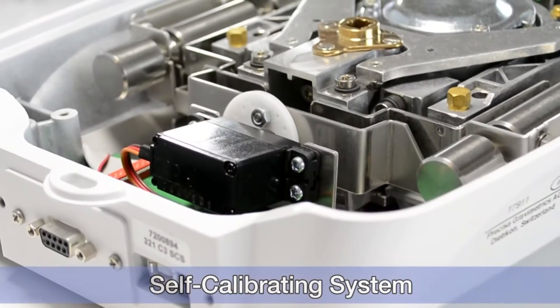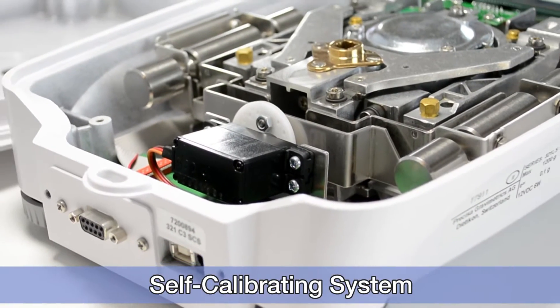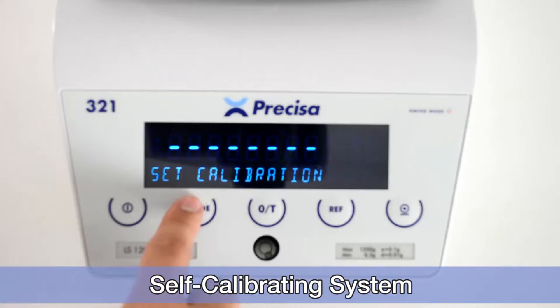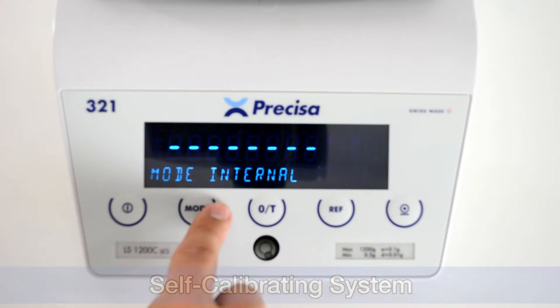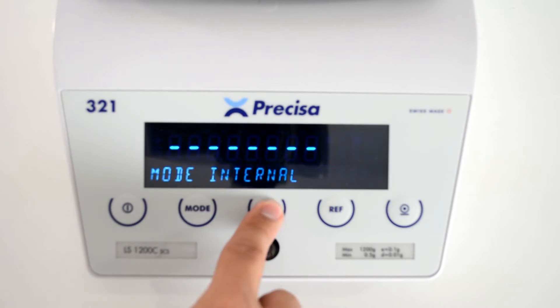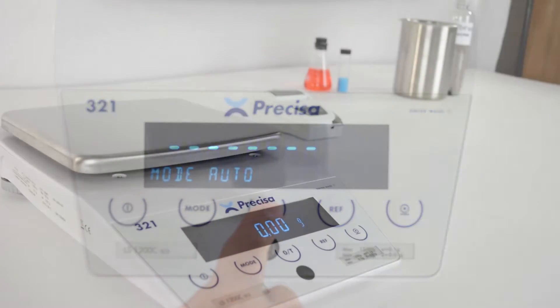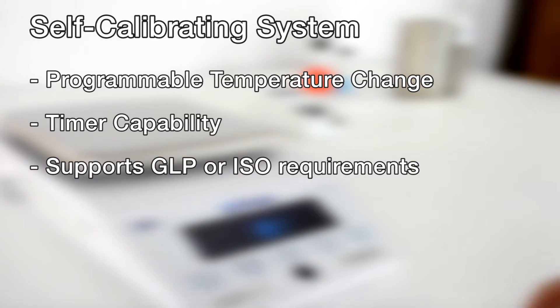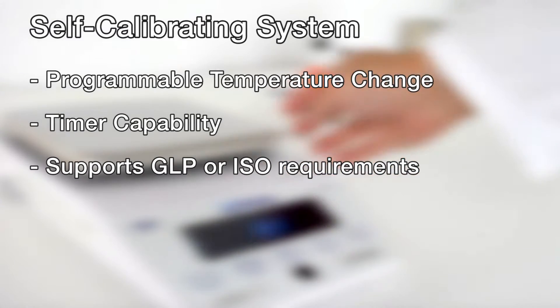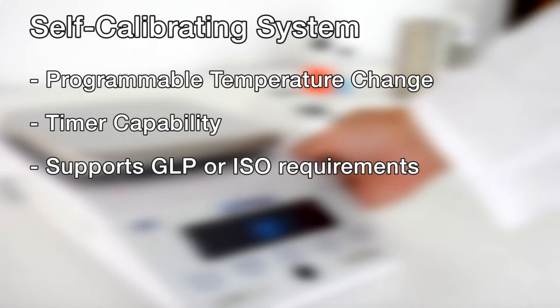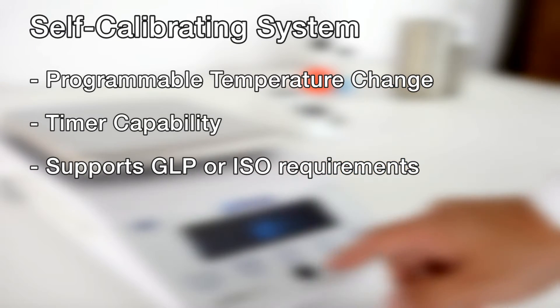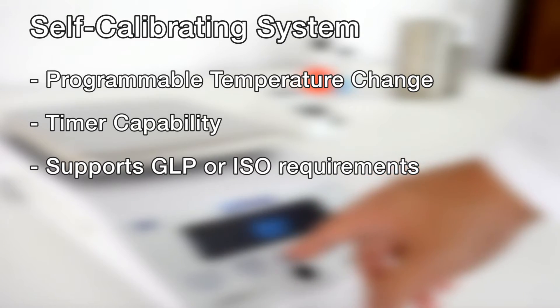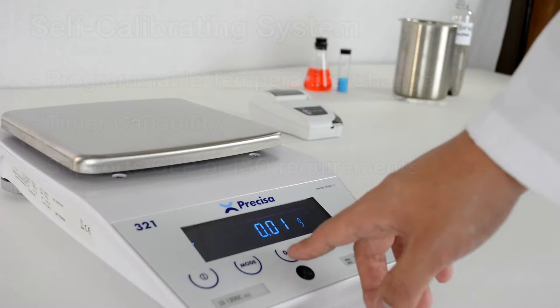The self-calibrating system, developed by Precisa, enables true automated balance calibration. The function features programmable temperature change and timer capability, which ensures that your instrument is always calibrated precisely to support GLP or ISO requirements.